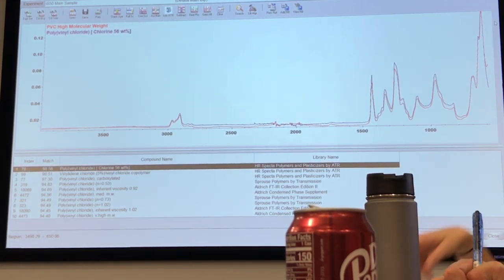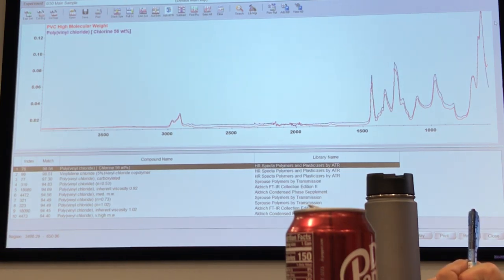How do diffuse reflectance measurements fit into that story? Because for mapping, we'd probably use that mode. Totally, yes. So with the reflectance spectrum, that's where the biggest problem happens.